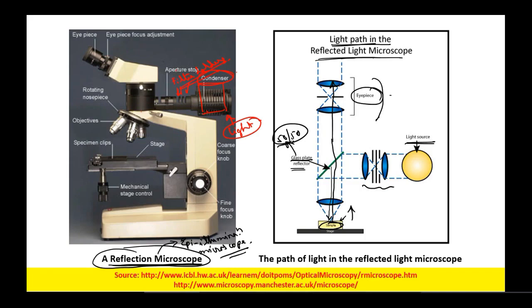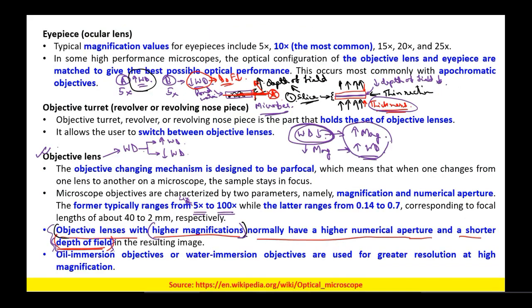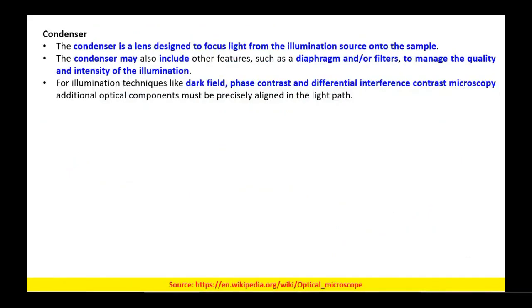Okay. Then we are having the aperture stop. In the condenser, we have discussed these apertures in our last class. Over here there is a diaphragm and/or filters. This diaphragm is basically an aperture system. It is just like our pupil, mechanically a concentric system.